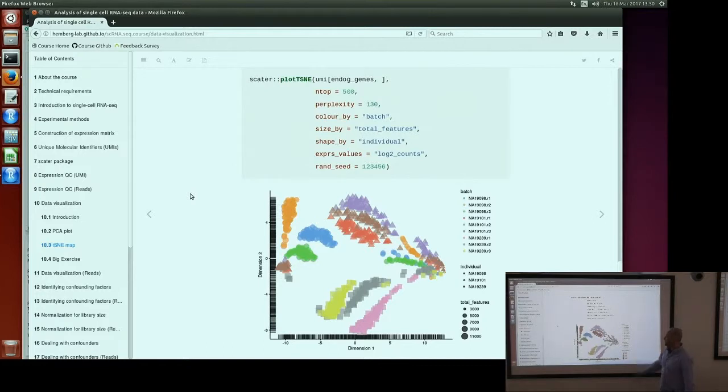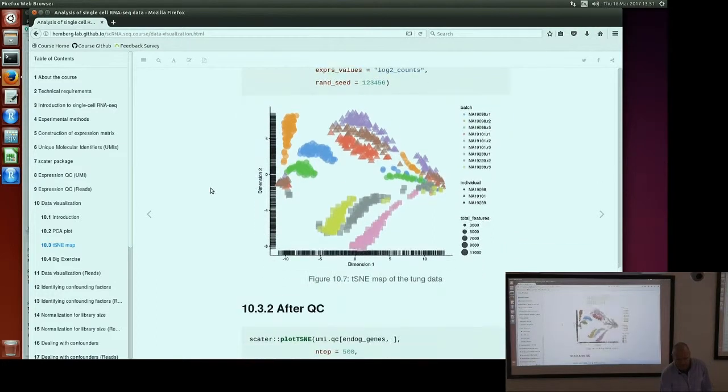And basically that's what you get from t-SNE, which is nice. So it separates different batches from each other. But it's very hard to say whether you have any structure in your data. So you can say that, yes, the batches are separated, but also this batch is split in 2 groups, right? The orange batch as well, which is actually the bad batch. You can still see some cells are here. So it's in a way a complicated algorithm. So it's not easy to interpret.